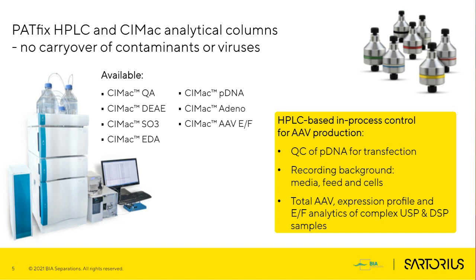Then I will show you how we did recording of background of media, feed, and cells used in our upstream setup. And then I will present orthogonal methods that you can use to track your total AAV as well as empty and full AAV particles, both in your upstream and early in your downstream setup. I will be speaking mostly about PATfix switch HPLC.